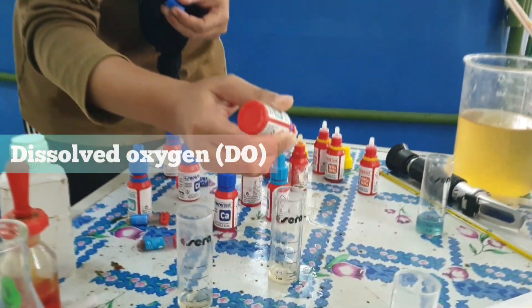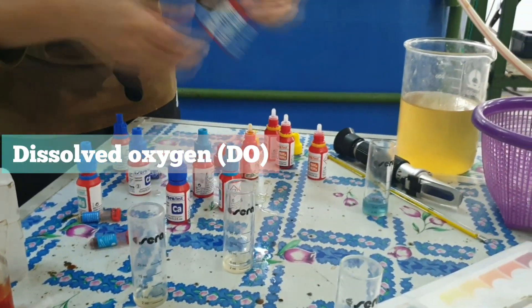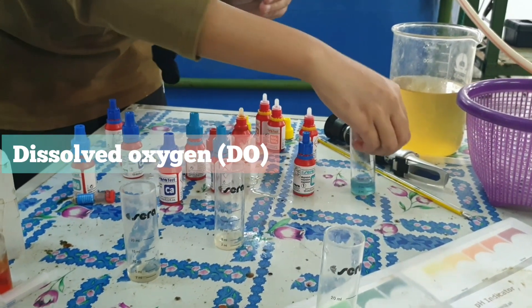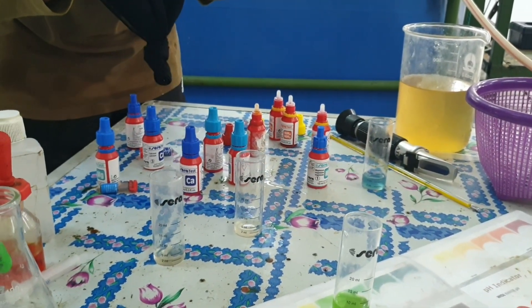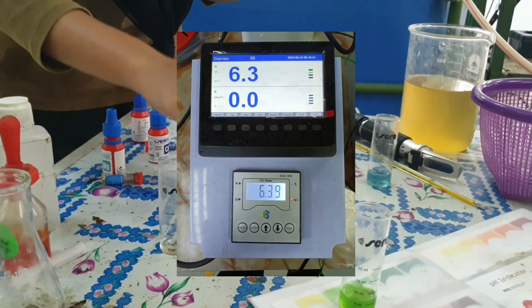As you are aware, dissolved oxygen — DO — is one of the critical water parameters that must be monitored in order to maintain a healthy aquatic environment. To measure the concentration of DO in the water, a dissolved oxygen meter is used.